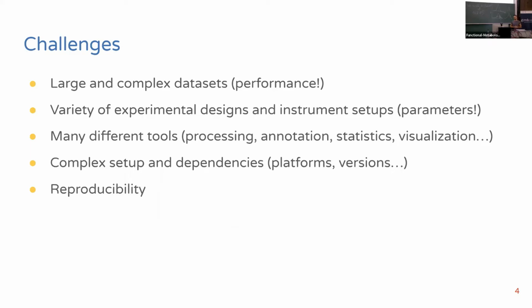Our experimental designs, as we heard, can vary quite a lot. Also our instrument setups: we have different machines going on, and depending on that, we have to set parameters accordingly. Also, there are many different tools around that we can use, and we have to get them working together. For processing, like MZmine, then the annotation tools like SIRIUS and GNPS, and different scripts for statistics and visualization.